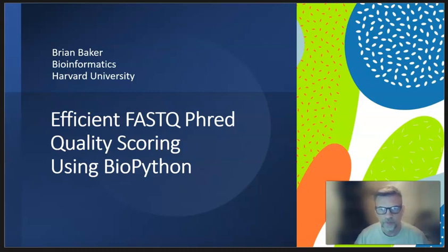Hello, this is Brian Baker, and today I'd like to speak about efficient FASTQ Phred quality scoring using BioPython. This presentation aims to demonstrate how to obtain Phred quality scores as quickly as possible using the available methods within the Python programming language. In addition, I'll examine how to identify patterns within the quality scores, such as low-quality distributions, to help ensure the accuracy of the nucleotide data.